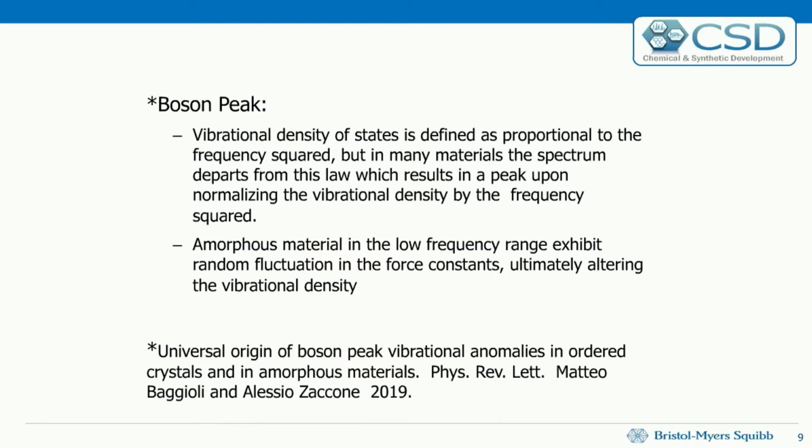We know it, and again, this goes back to tradition, and this is why you use DSC, for example, as one of the primary methods, because you're looking at the heat capacity changes. Because we know amorphous material, when you go through an amorphous change of state, there's a heat capacity change in this glass or amorphous state, much like typical window glass.